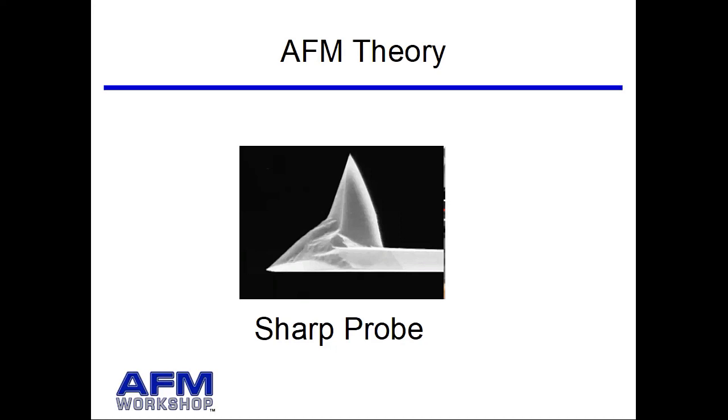And we get the question, how long does the tip last? Once you learn how to use the microscope, a tip can last a week or a couple of weeks. But when you're learning how to use it, sometimes you break the tips and you have to replace them a little more frequently.